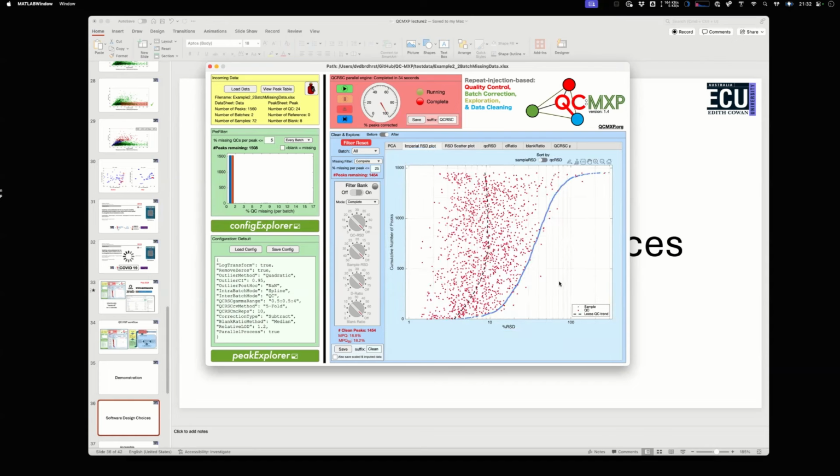There's another type of plot which is a bit more complicated, but actually more useful. I've called it the Imperial plot because the guys at the Phenome Centre at Imperial College London were the first people to use it. And it's basically a pair of points.